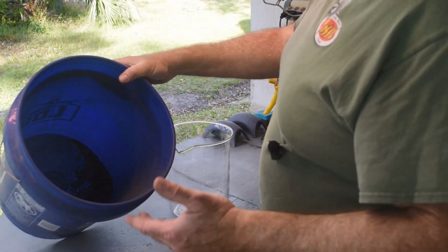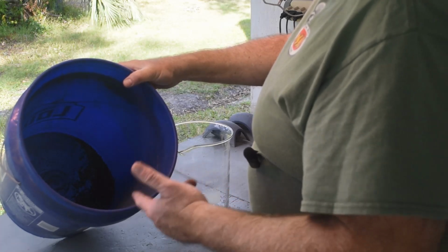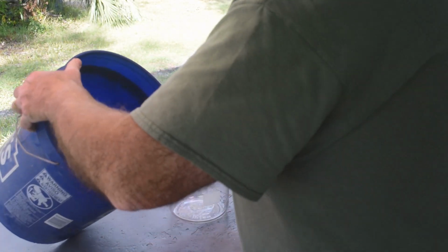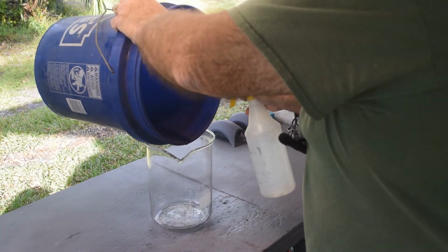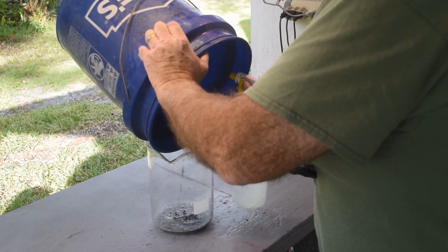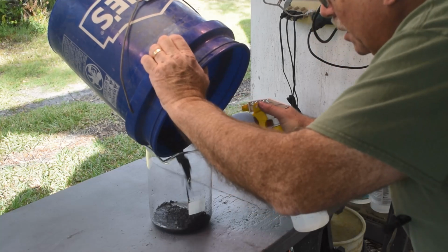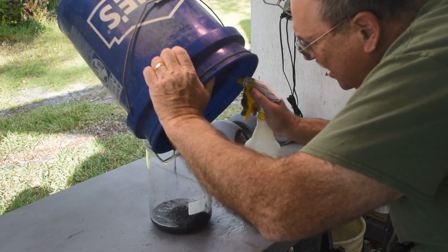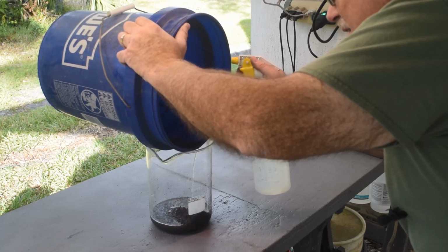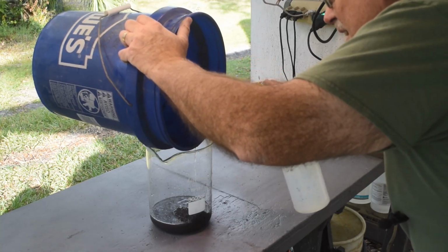I'm going to run an experiment and see whether I can pre-treat this stuff with either sulfuric acid or hydrochloric acid to get rid of the iron out of it before I go to poor man's nitric or straight nitric acid, one or the other. So depending on what I do next, I don't know if I want chlorine in here or not. So I'm gonna wash this stuff out of here with distilled water. You know, the gravity separation was done with tap water, but I might not want chlorine in here going down the road. So I'm going to use distilled water here to get this stuff out of here. And I'll rinse it a couple of times with distilled water. If I decide hydrochloric acid works better, then this was probably a waste of time, but oh well. It's not too big a waste.